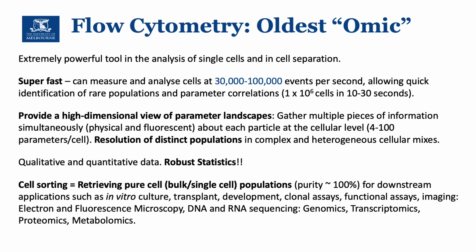The other important thing is that since you're analyzing so many cells, you get a pretty fair idea of statistical robustness. So when you're saying the percentage of expression is this, you are confident in the numbers because you have acquired enough cells to trust the statistical outcome.